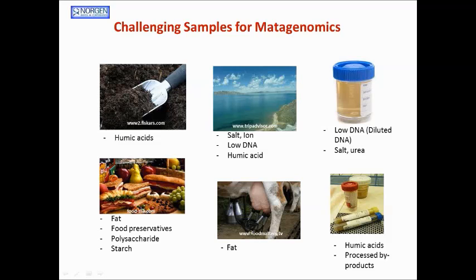The ocean, including salt or fresh water, usually contains different levels of ions that also inhibit DNA purification, particularly column-based purification systems. Depending on the water sample, particularly from the river and the sludge in it, humic acid can cause poor DNA purification. More importantly, low DNA is a key issue: how to concentrate the DNA from a vast amount of water samples.